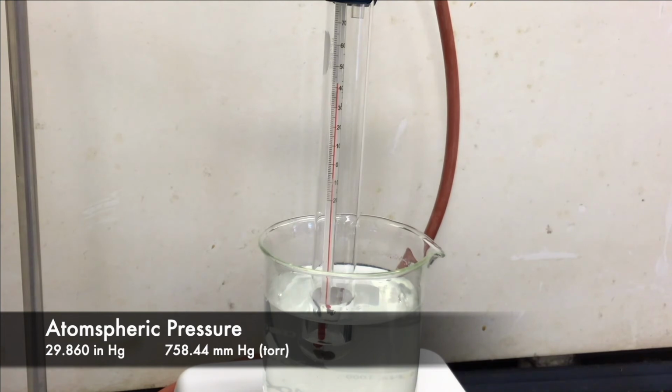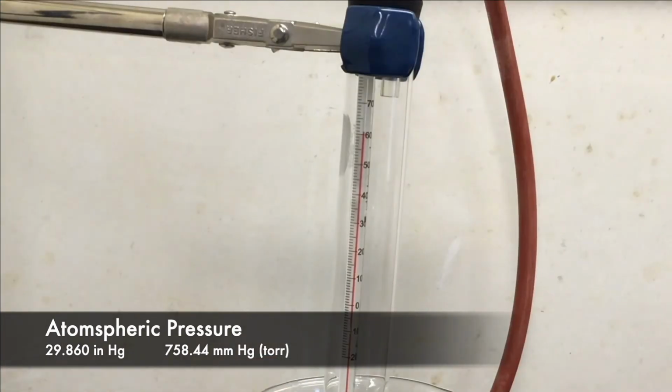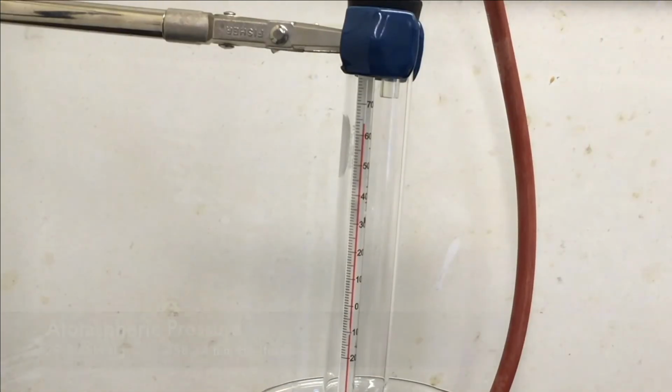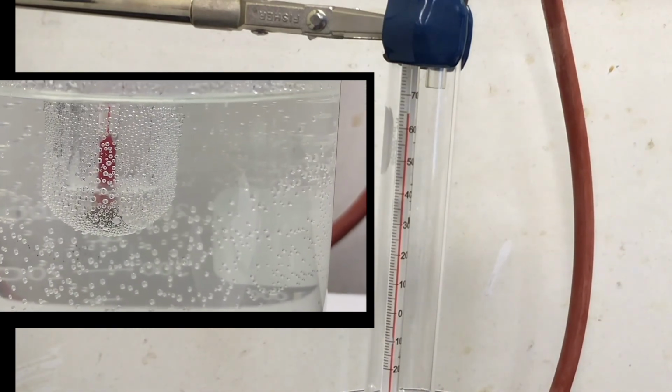We're going to position our thermometer at the surface of our liquid. Next, we're going to position our test tube in a 250 milliliter beaker filled with water and clamp it in position. When everything is in position, we'll add 3 boiling stones to our beaker. Then we're going to watch the liquid in our test tube until we see boiling, and record the temperature in which our unknown boils. We start to see boiling at about 64.5 degrees Celsius.